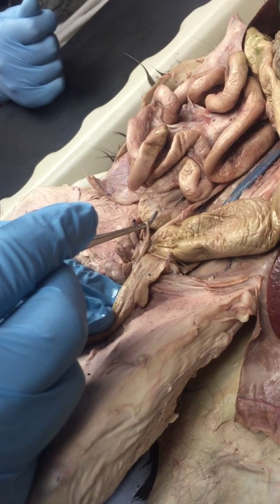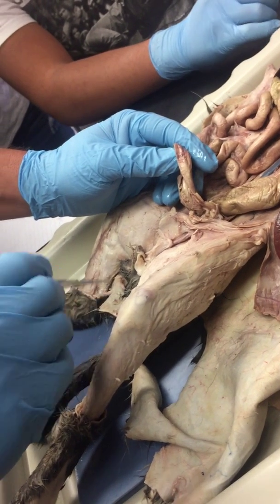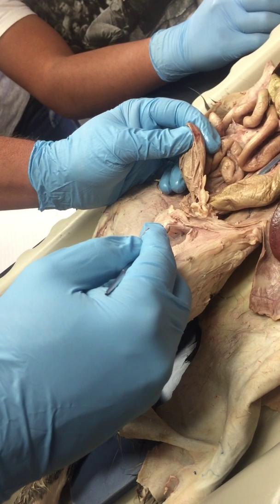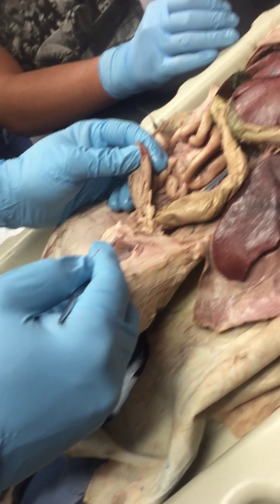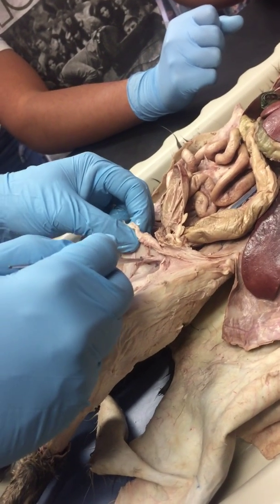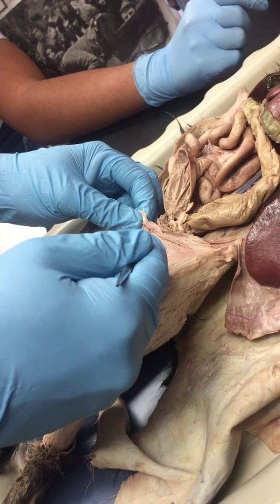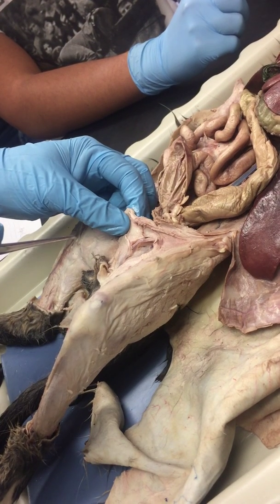Okay, so those are the male parts, penis, scrotum with the testes inside, and then our semen tubes right here. This is the internal semen tubes. These are the external semen tubes, directly underneath the skin. That's good. Now, part of the difference between a cat and a human being is there is no external part. Everything's internal in a human being.